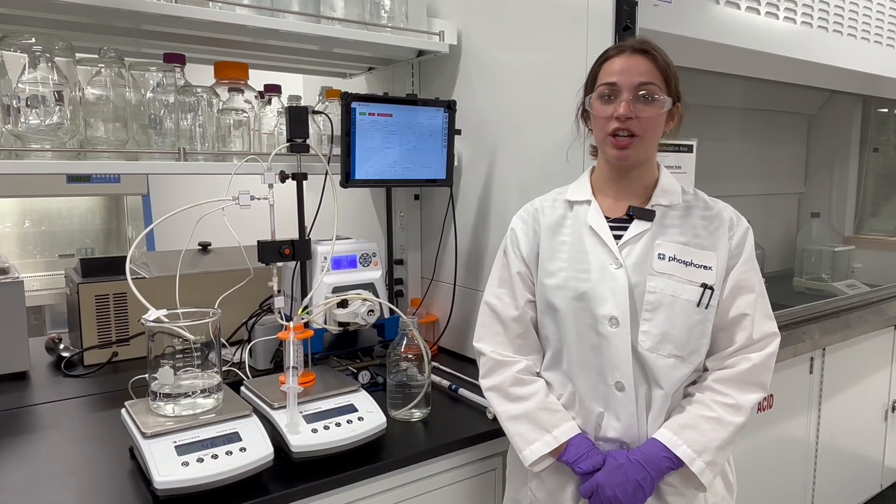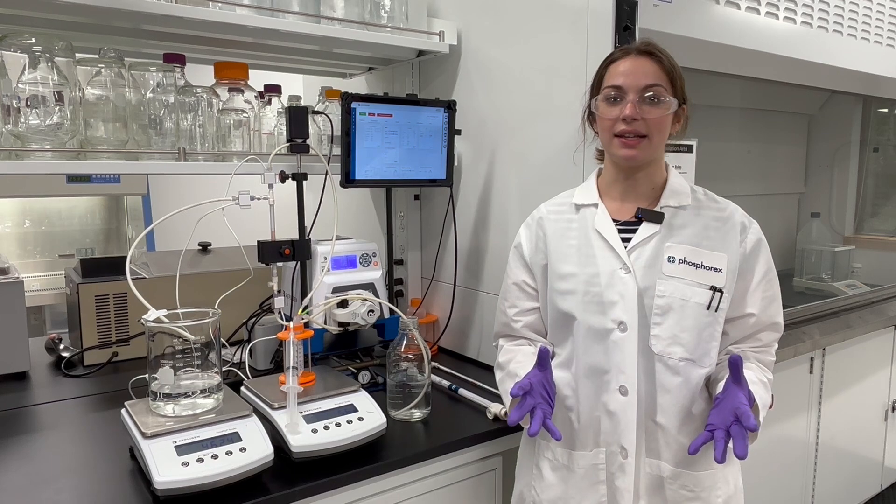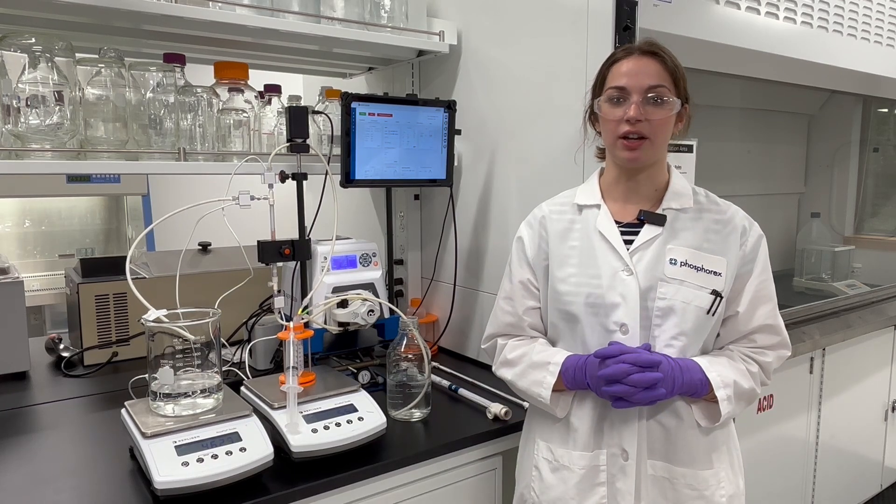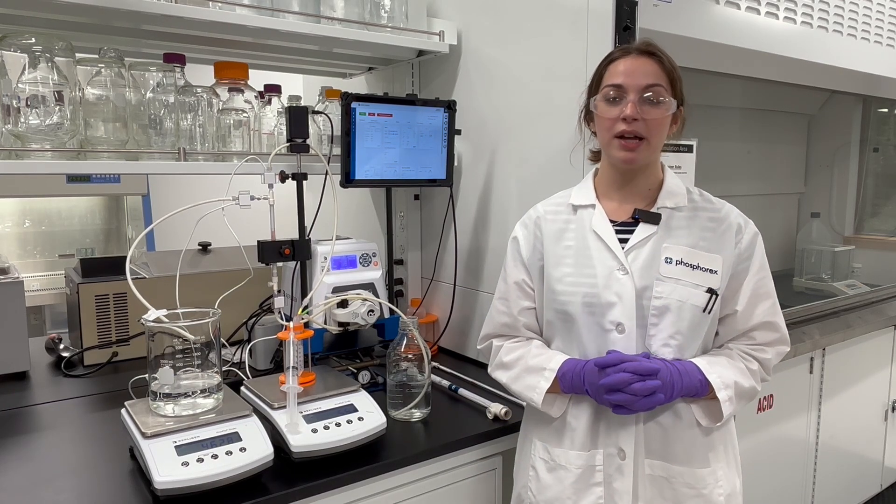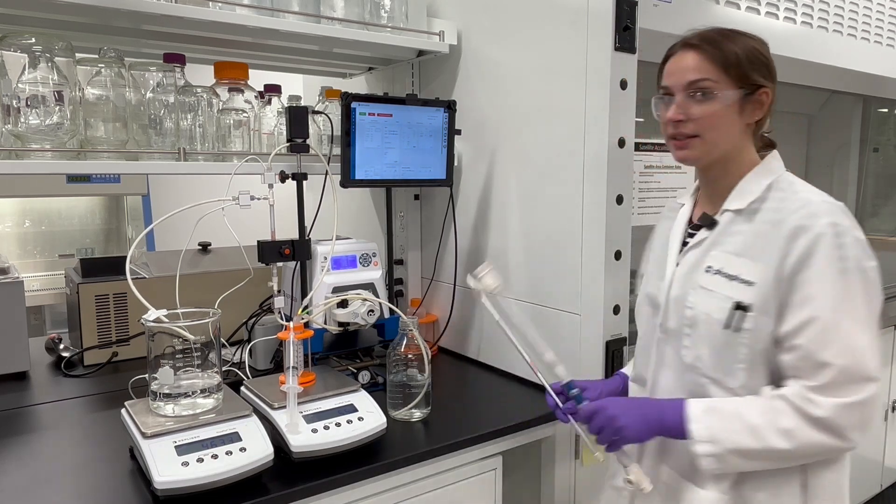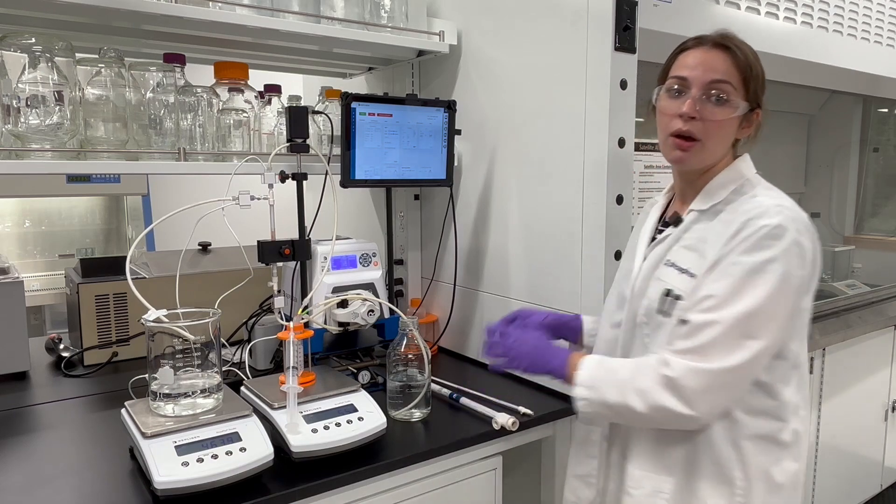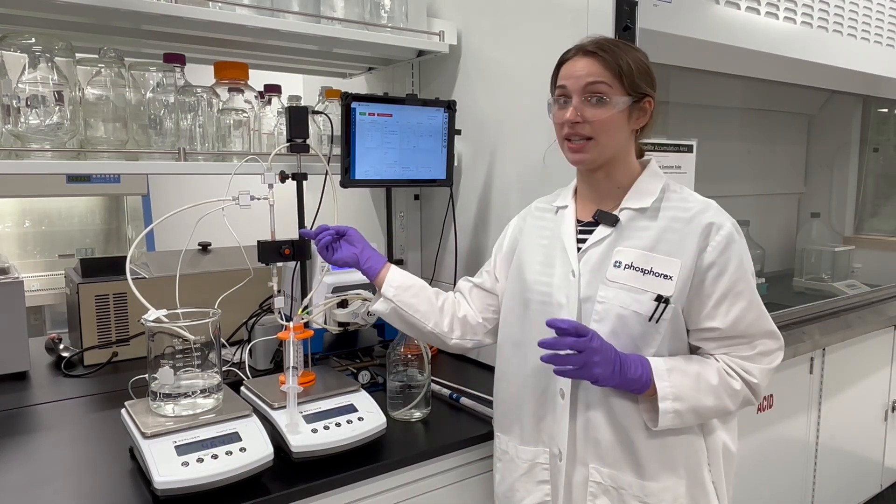With the optimal concentration, TMP, and flow rate now identified, column loading is assessed to determine the optimal column surface area for the batch scale, which can minimize the cost of larger hollow fiber TFF columns that have a greater surface area, such as these, if a higher column loading can be achieved on a smaller, more cost-efficient column, such as this one.